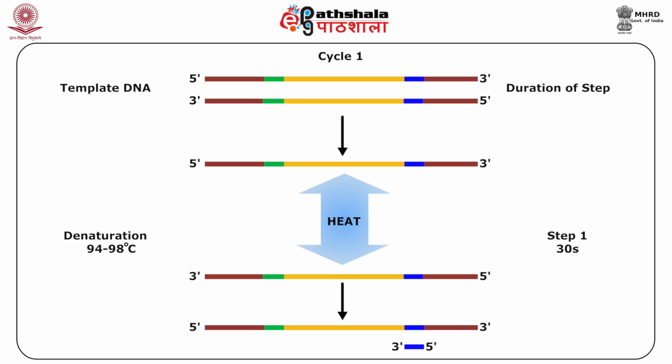The second step is the denaturation step. It is the prime repeated cycling step that comprises the heating of the mixture containing the template DNA at 94 to 98 degrees Celsius for 20 to 30 seconds, and can extend up to 1 minute.